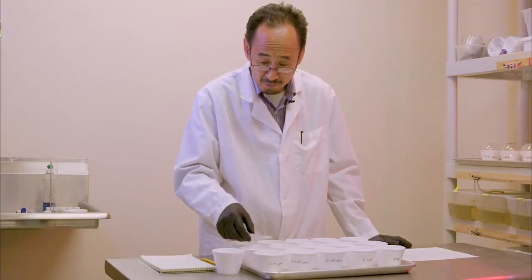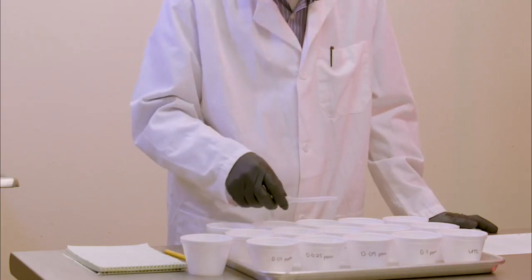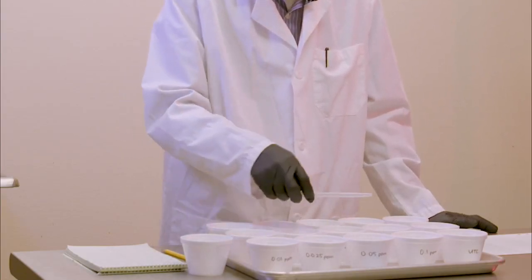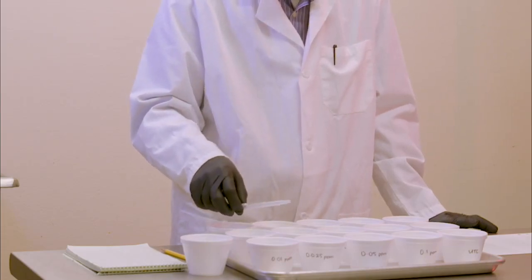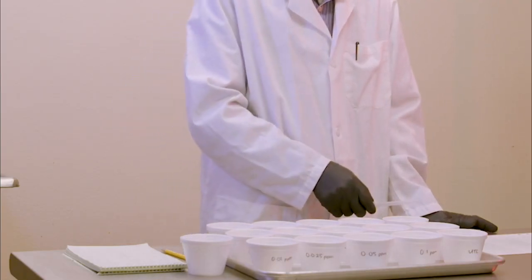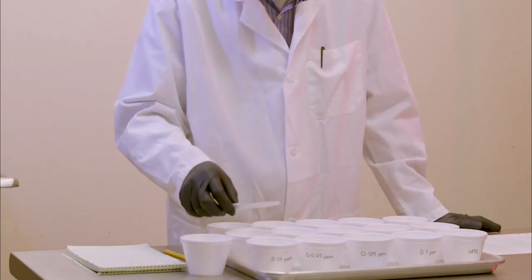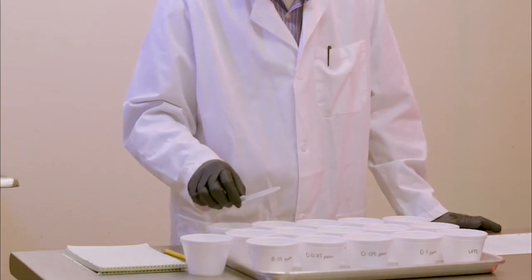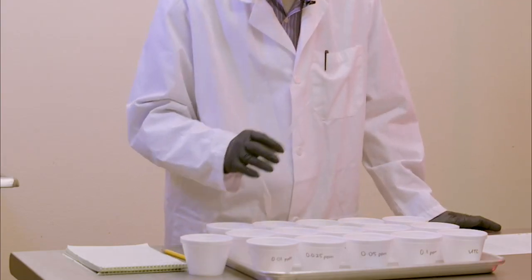Ideally, you will see a low amount of mortality in the lowest treatment concentration, say between 5 and 15%. The larval mosquito mortality should increase directly with pesticide concentration across the array of cups and reach high levels of mortality, around 85, 90, or 95%, in the highest concentration of pesticide being tested. You probably should do the lowest concentration first because your cups and pipette are comparatively clean. You finish all the replicates in the lowest concentration and then you move to the next higher concentration, and so on, until you count the number of survivors in the highest treatment concentration.